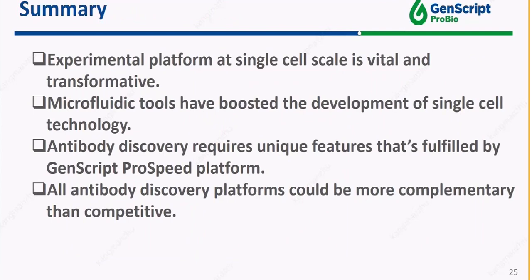With that, I want to summarize this webinar and leave you with some take-home messages. First, I talked to you about how experimental platform at single-cell scale is vital and transformative. And microfluidic tools have really boosted the development of single-cell technology. Aside from single-cell resolution, antibody drug discovery might require some unique features that are fulfilled by GenScript's ProSpeed platform. And finally, all antibody discovery platforms can be seen as complementary rather than competitive. Thank you for all your attention, and now we're gonna take some questions.